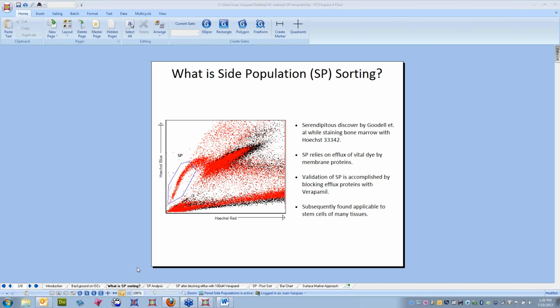And this overlay is a very nice feature of FCS Express 4. Traditionally, what I've had to do is take these two plots into Photoshop and create layers and make one transparent and put it over the other, and it's a real pain. So I'm really happy that this function is here, because sometimes you want to track multiple plots and backgate them to one source plot and overlay all of those. And so this will be very useful.